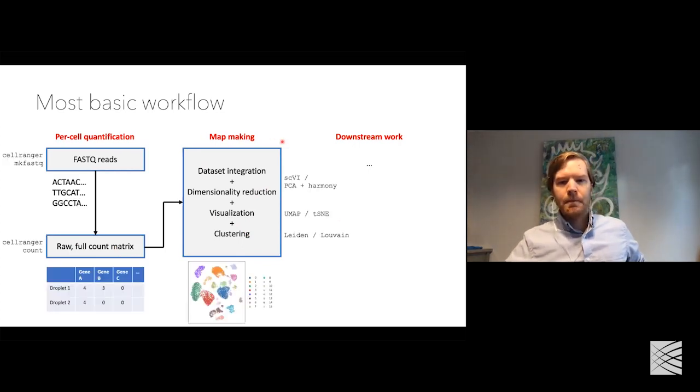Stephen, just to interrupt you with a question that came up in the Q&A. Thank you. The question, now there are two. The first question is, does the UMI come in the original droplet and what does it look like? And the second question, which I'll ask now because it's closely related, is how do you get the UMI to tag each individual molecule? Great questions.